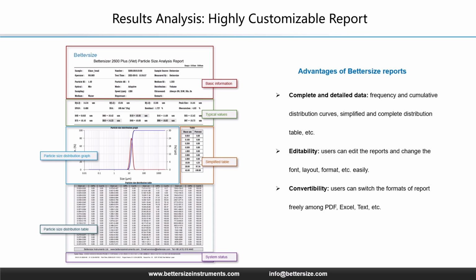Furthermore, we ensure convertibility. With a single click, you can export these reports to PDF for secure sharing or to Excel and text formats for further offline analysis. This ensures the data leaves the instrument in exactly the format your workflow demands.